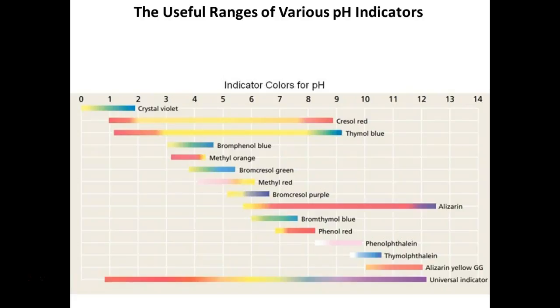So can a methyl red negative organism cause the pH of the methyl red media to drop below its initial value? What do you think? So if your organism was negative, which means it's not 4.4, does that mean it's still not acidic? It could be acidic. Actually, we should take out some. I might bring us some pH paper in next time. We'll measure the pH of y'all's methyl red test media. Let's see. So the answer is yes. Does that make sense to you guys? Okay. The next questions might help you.